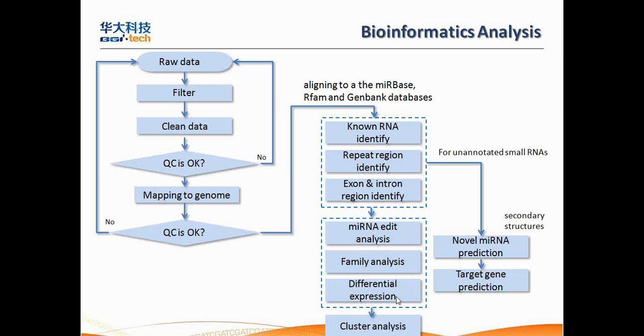We can also calculate the expression value of this microRNA and compare across different samples to figure out whether it is upregulated or downregulated. We can also do cluster analysis.